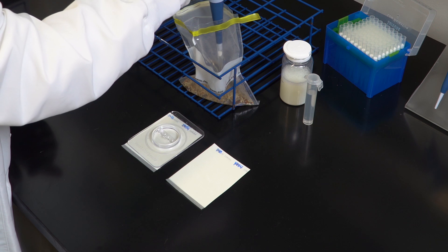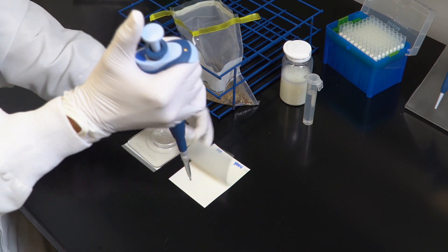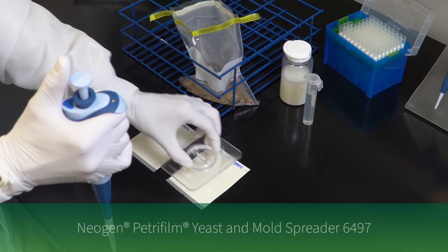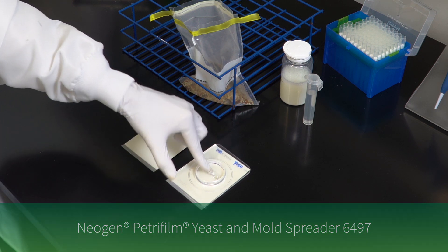To inoculate, lift the top film and dispense one milliliter of the prepared sample onto the center of the bottom film. Roll down the top film and place the Neogen Petri Foam yeast and mold spreader over the sample. Press gently to distribute the sample evenly.